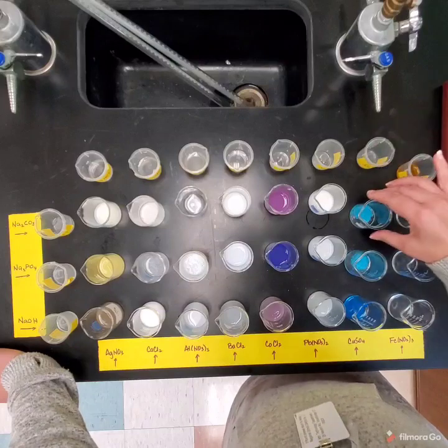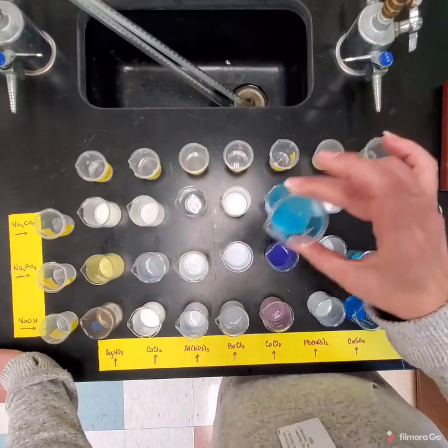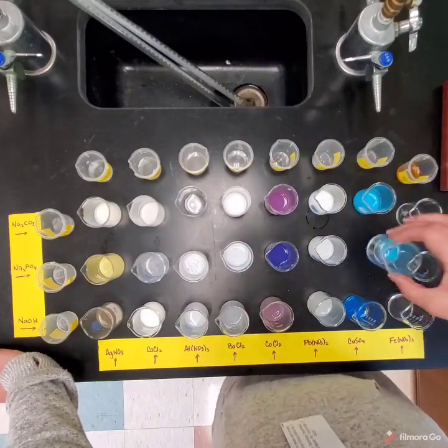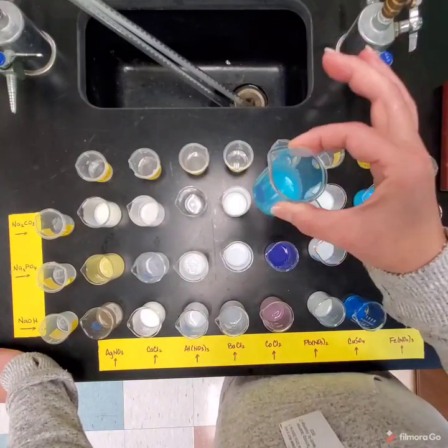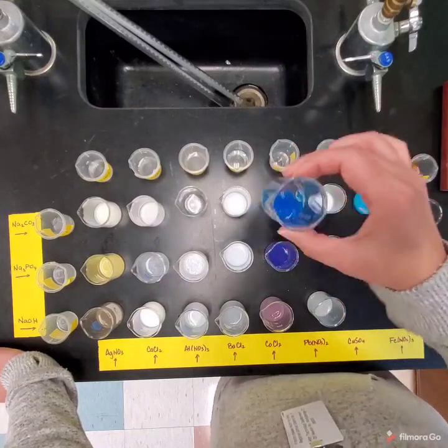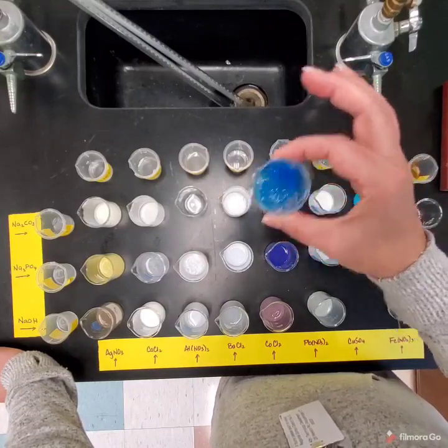All right. Copper, the precipitates are very gel-like, very goopy, very thick, almost like Jello that's almost quite set. Okay, you see it's got this gel kind of goop. I don't know if you can see it. And then we get this very pretty blue color.